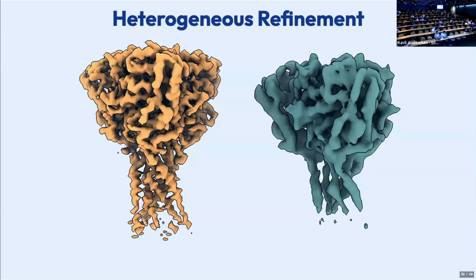And I also think, like I said, you can try both. When you run 3D-VA, 3D variability analysis, it will give you a distribution of your particles along a coordinate, and we'll talk about this more later. If you see that basically all the particles are in this Gaussian peak or that Gaussian peak, and there's not really much in between, you can say, based on the particles I picked and the specifics of this job, it seems more discrete. Or if there is one big Gaussian spread across the coordinate, maybe it seems more variable. But then, like Ali said, and like you mentioned as well, you can't ever be certain.